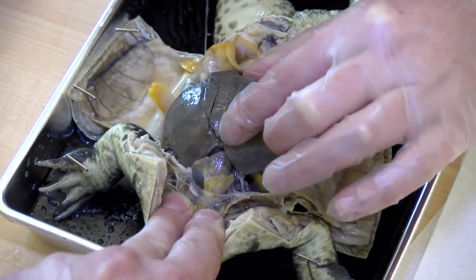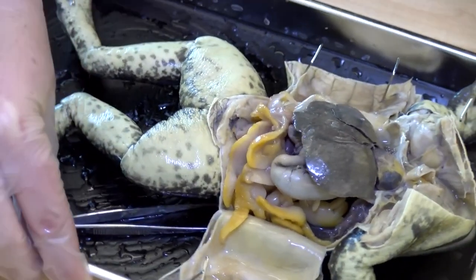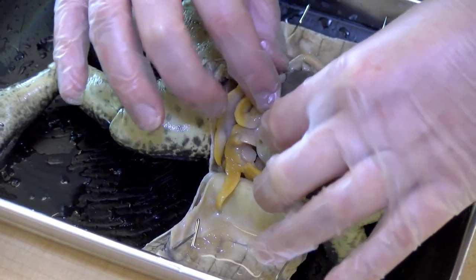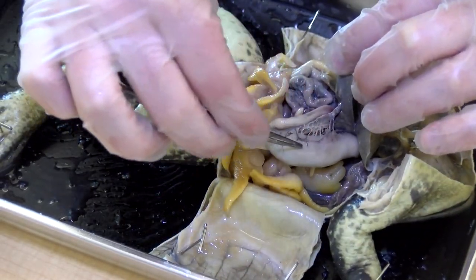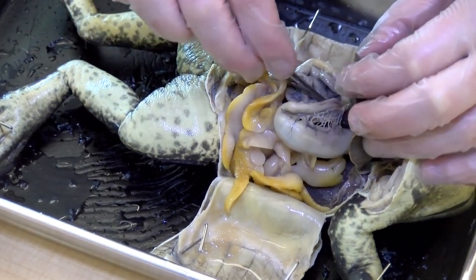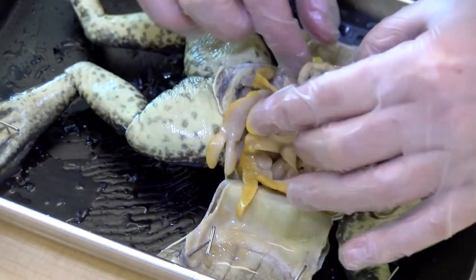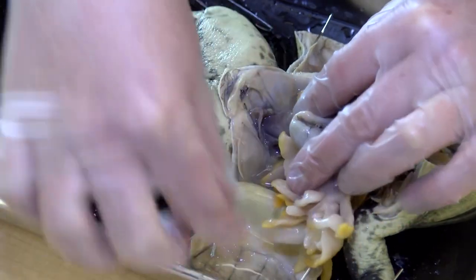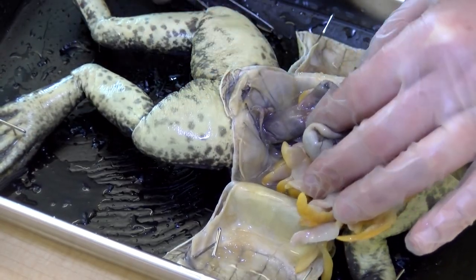If we look underneath the liver, we've got the stomach right here, which connects to the small intestine. Continuing along, we can move these fat bodies out of the way — that eventually connects to the large intestine, and then it would exit the frog.